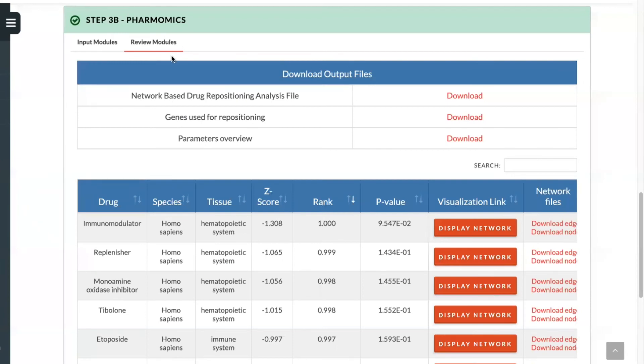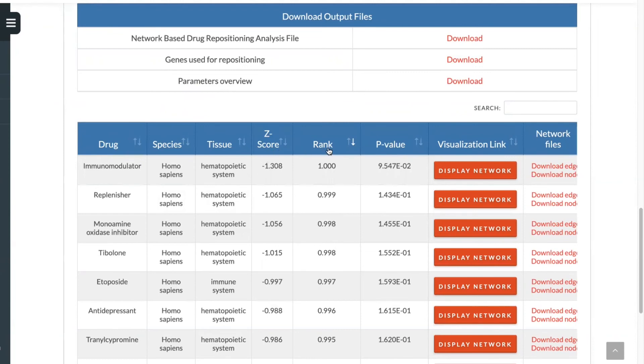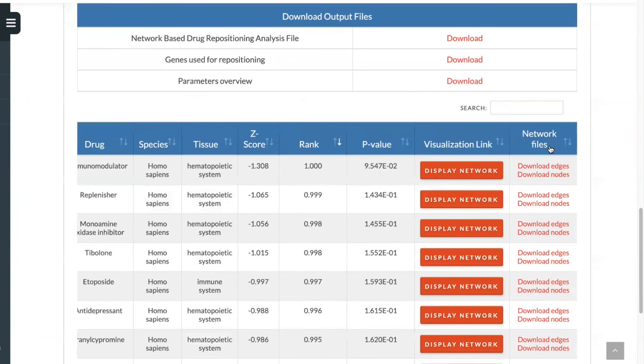Upon completion of the network-based drug repositioning analysis, you'll be able to download your output files by selecting the download options here. You can also see in this table the drugs, the species that those drugs were tested in, and the tissue. In addition, we provide the z-score, the rank, the p-value, and network files that you can download, the edges and the nodes. Additionally, you can display the network by selecting any of these links.